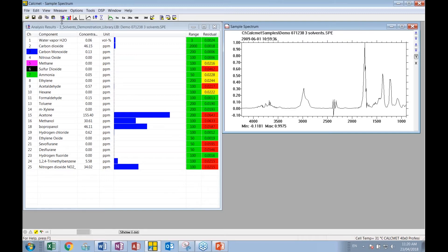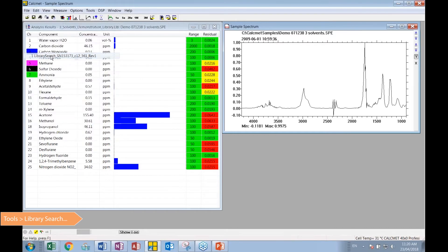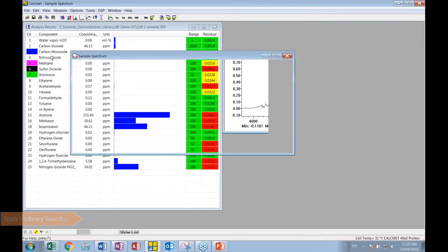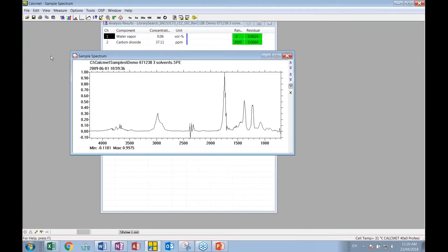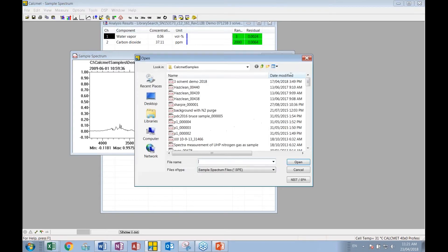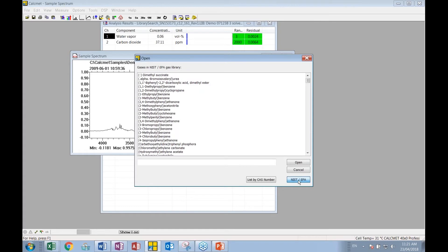So the next step for the user is simply to change to a library search function. So what we've done here, we're still dealing with the exact same sample. We've basically taken the water and the CO2 out of that. We have loaded the NIST EPA library. So that contains 5,224 currently.